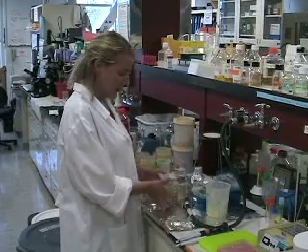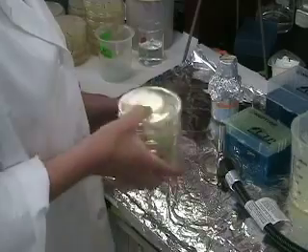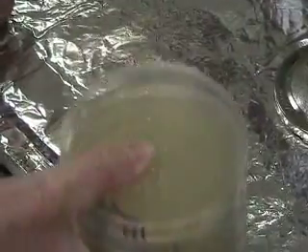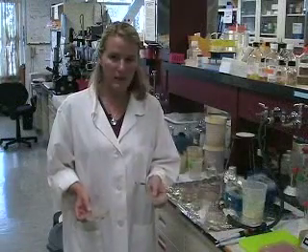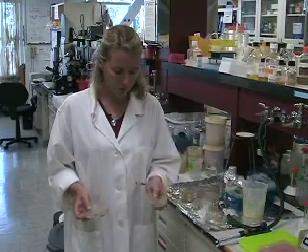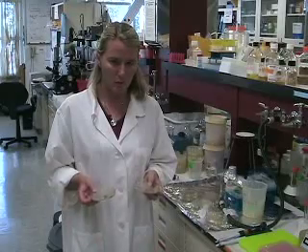After you add the beads, you put all your plates in a pile and gently shake them to have the beads spread the bacteria everywhere evenly on the plates. I move the plates until they are dry.